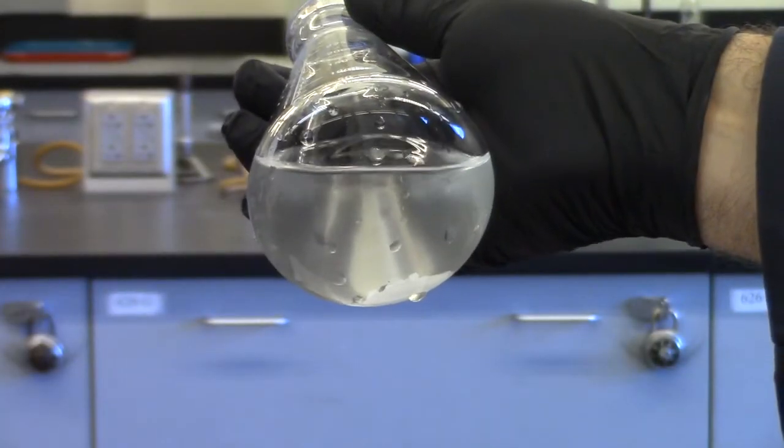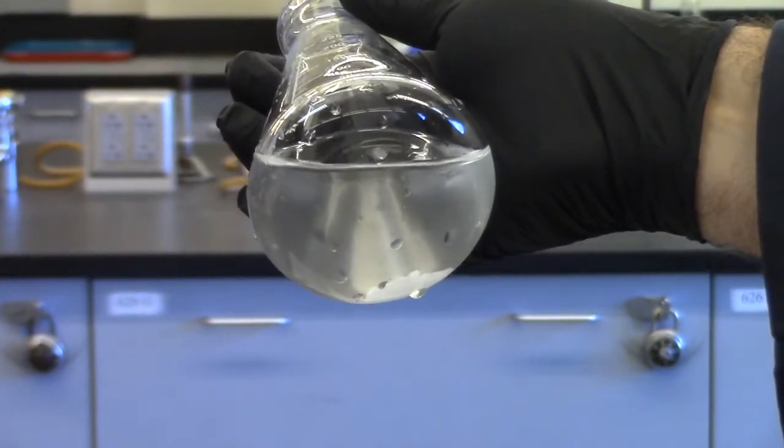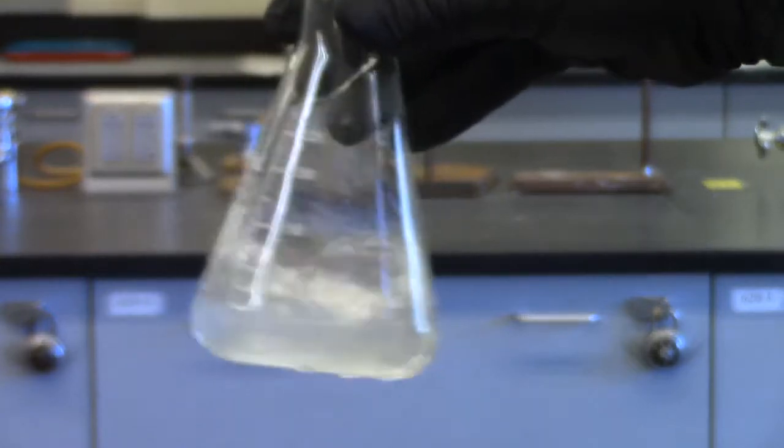Thermodynamics of borax solubility. In this lab, you will be determining the delta H and delta S values for the reaction which occurs when borax dissolves in water.